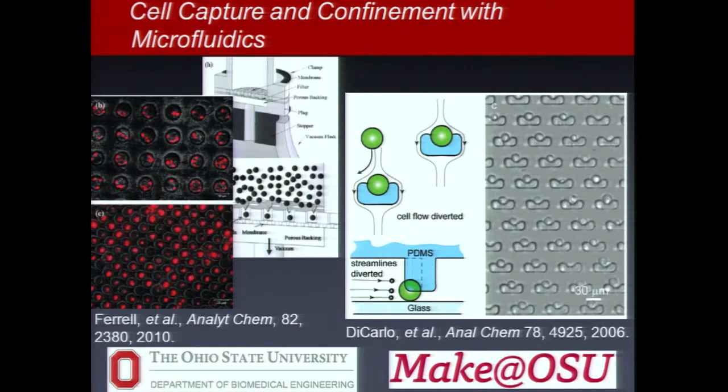The other one comes out of our lab, which is instead of having flow in this direction, have it flowing normal to the microfluidic system, but in this case now using some of those fiber mats that Jed was talking about, we can collect cells within these, and we have them spatially isolated from other cells, and so we've done experiments looking at, for example, cluster formation and its effects of mechanically confining clusters in terms of their differentiation.